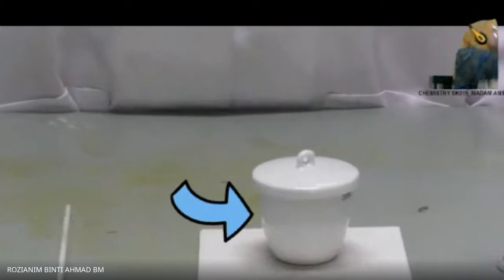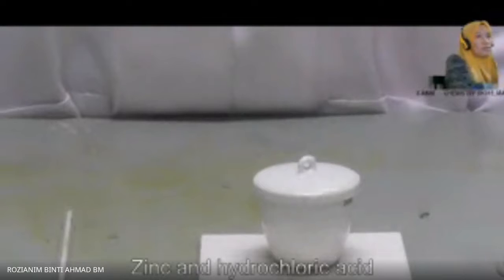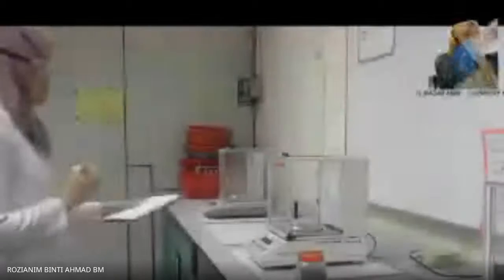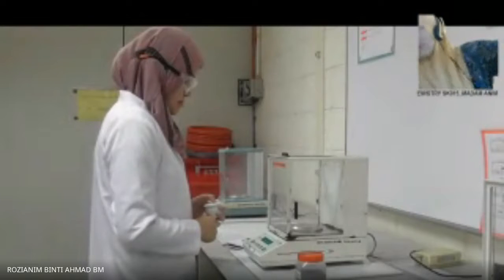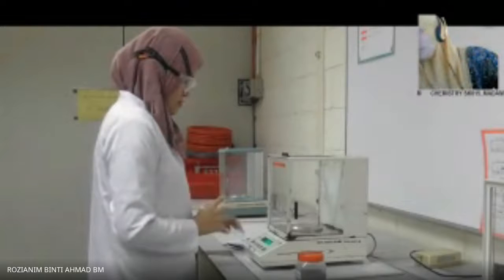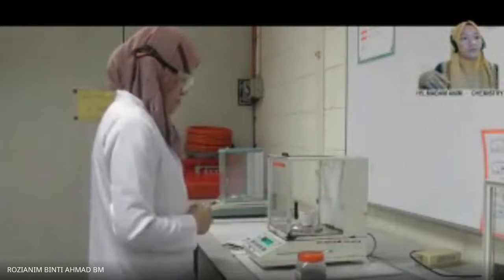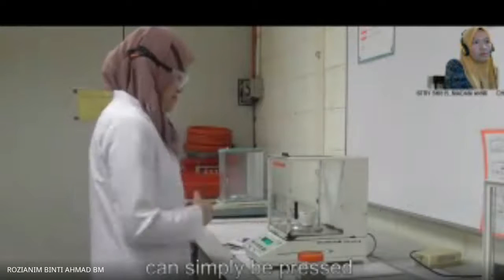This is a crucible and its lid. Zinc and hydrochloric acid will be mixed in this crucible. But first, weigh the zinc powder. Is it necessary to record the mass of the crucible when the tare button can simply be pressed to get the mass of zinc?